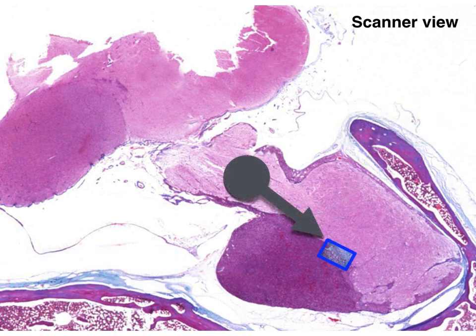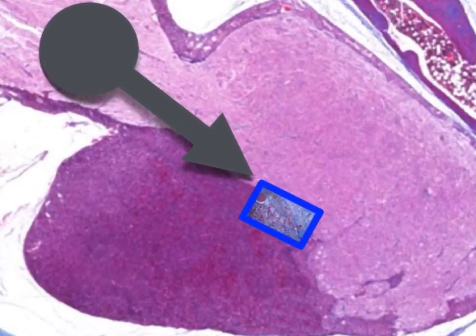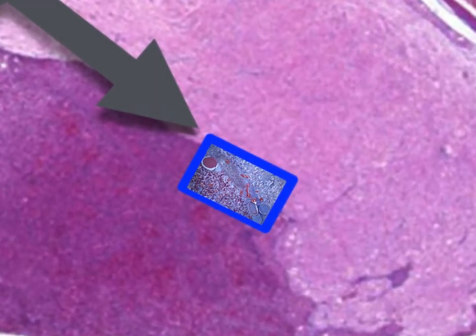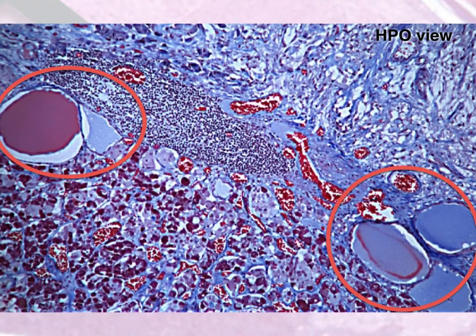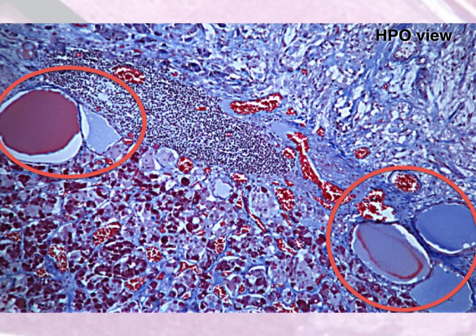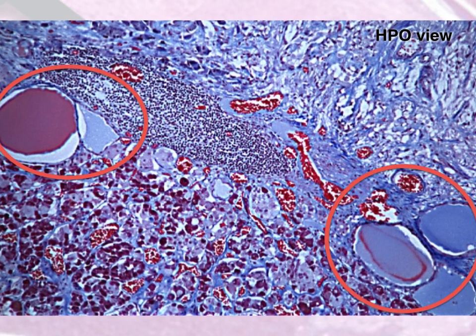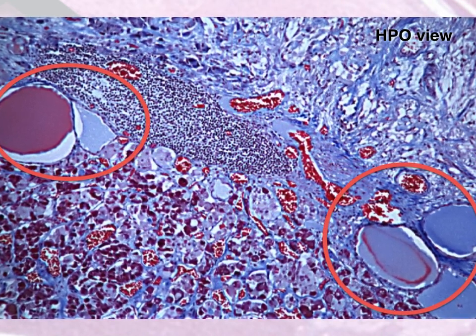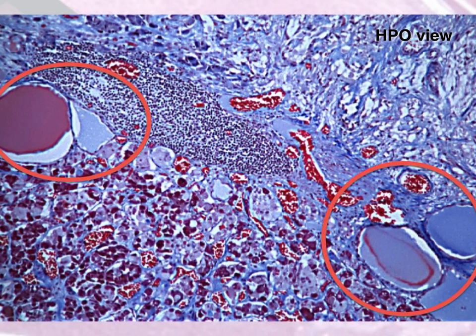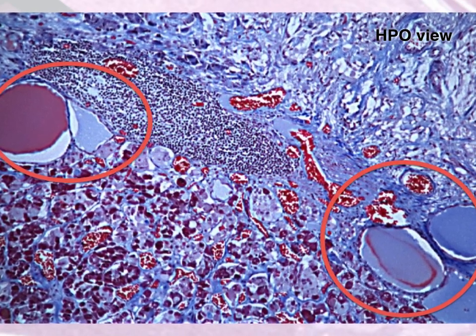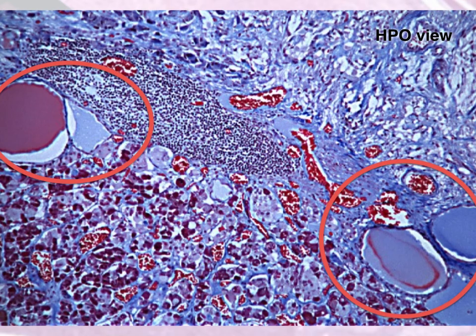Let us now focus on the portion of the anterior pituitary gland that is in intimate contact with the posterior pituitary. This is called the pars intermedia. At high magnification, we can see that this part of the anterior pituitary gland is characterized by the presence of colloidal structures. These colloidal structures are called Rathke's cysts. The pars intermedia secretes the melanocyte-stimulating hormone.